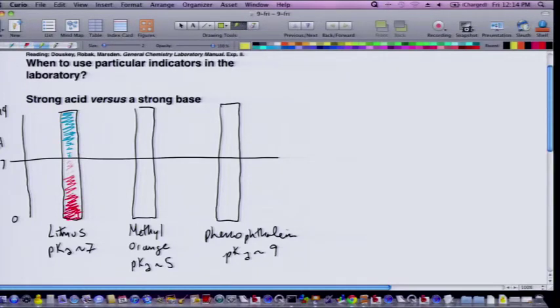And then there's methyl orange, which we talked about in some detail, which is very yellow when it's deprotonated, and then around pH 5 it becomes a deep orange. You might mistake it for red-orange. I got in trouble, I say trouble jokingly, for calling it reddish, more reddish than orange, but there it is. You'll have a gradation of color between orange, light orange, and yellow as you go through that plus or minus, say, 0.8 units away from that pKa.